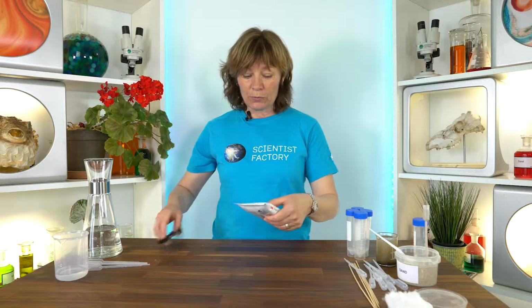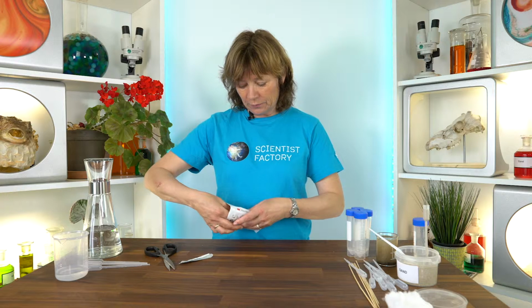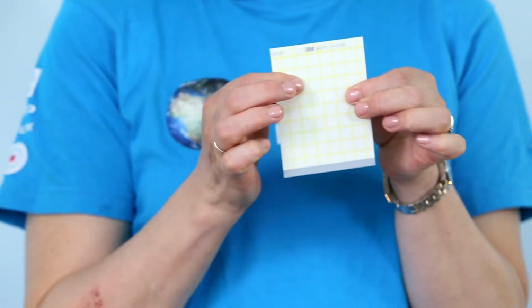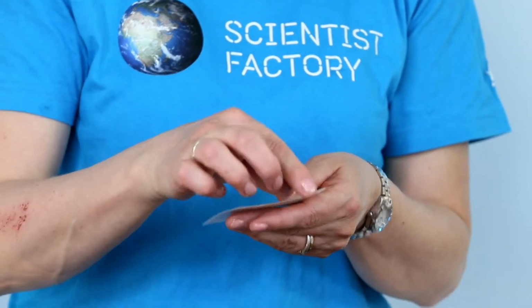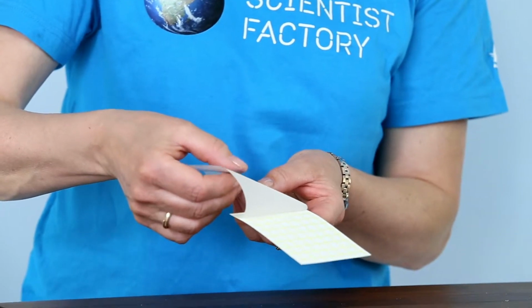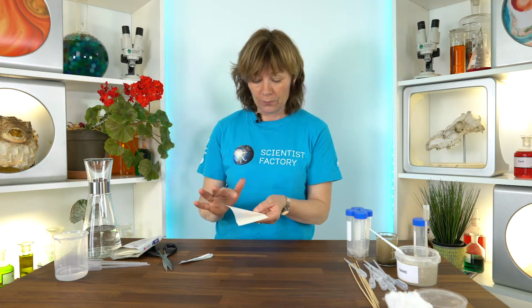And we will use something called a Petri film. They are thin sheets. And I suggest that you hand this sheet out to all your students to make them feel and touch it, and open it here and touch the underneath here. And explain to them that this dry substance they feel here, it's actually a dry gel with a lot of nutrients that bacteria living in water love.